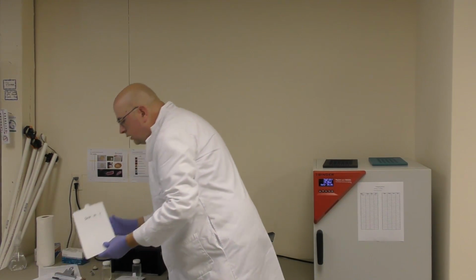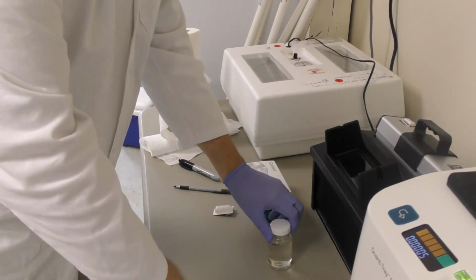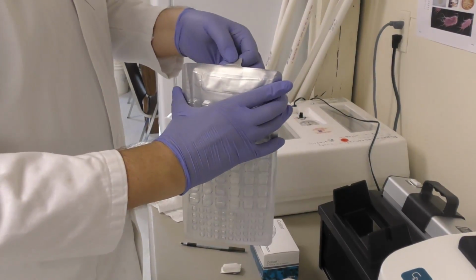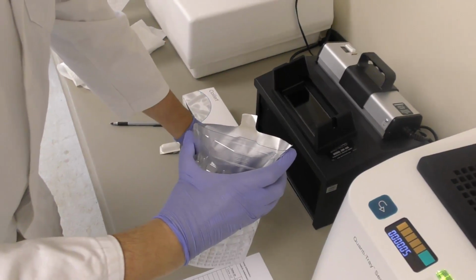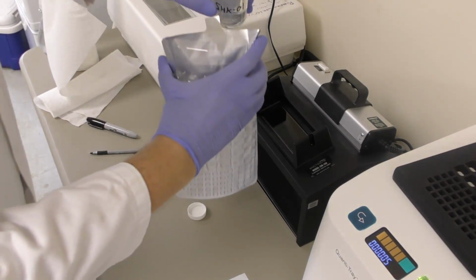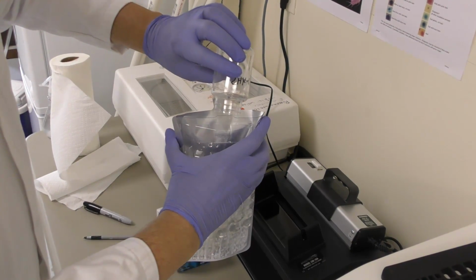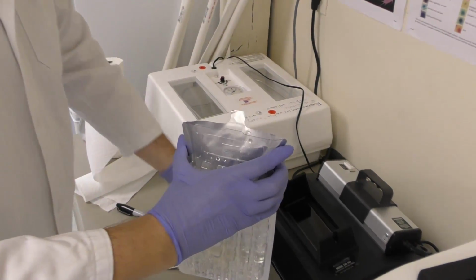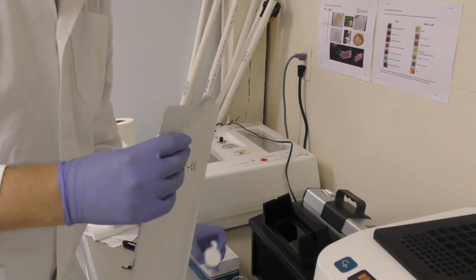And then with the plastic side facing your palm, you bend it, bow it inwards, and then you pull this flat back a little bit, and that'll create a little pocket, just like that. Okay. And then what you do is you pour your sample volume, and you really don't want to spill any of this, because then you won't be having 100 milliliters. So get as much of that out as you can. And then you close your pack.